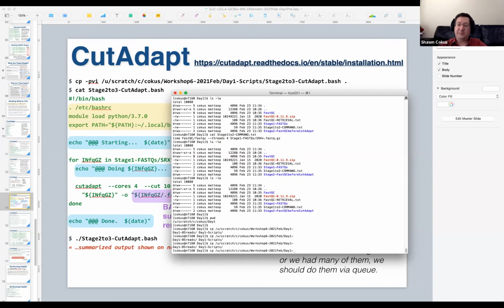If you keep pressing tab enough times, it'll list the ways it can complete. Obviously, we have the BS read subdirectory and the script subdirectory. So you just have to type S to get past the ambiguity and then tab complete. I think there's only one file in here, so tab complete right after that slash should give you the one file name that's in there.